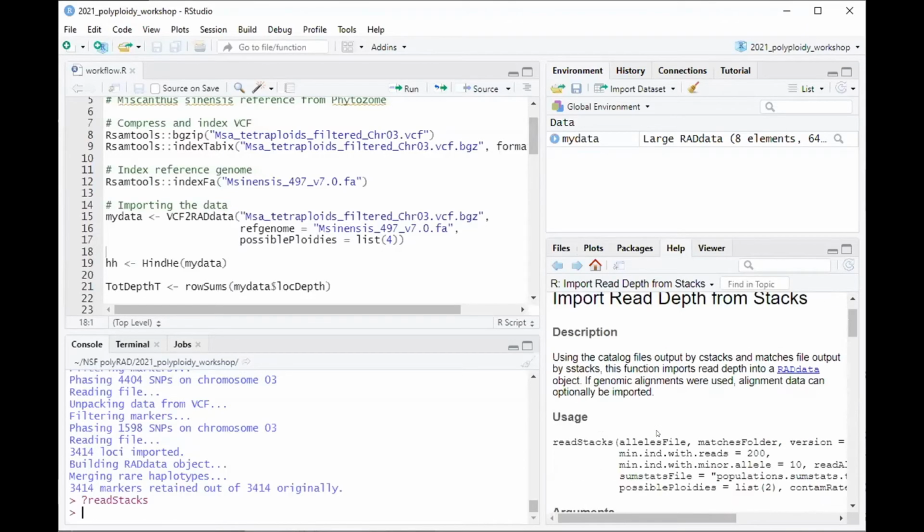Lindsay, could you explain a little bit more about how population structure works when doing SNP calling? Does the method assume distinct allele frequencies for each subpopulation? Yeah, the population structure method is more of an isolation by distance method, where it assumes there's sort of a continuum of allele frequencies across the population rather than discrete subpopulations.